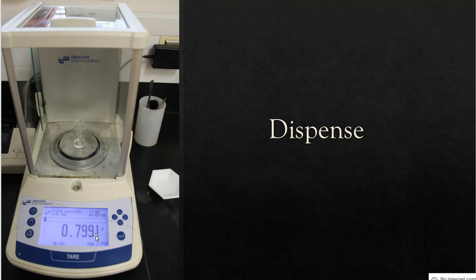And folks, grams over mil. Grams divided by milliliter is density. So grams divided by 1 milliliter, that's the gram value that I'm seeing there. So that means that's also the density value as well. All right, so test number 2 is already done. Look how fast that was. I mean, that took me like 10 minutes to describe, and it took less than that to actually do when I was in the laboratory.